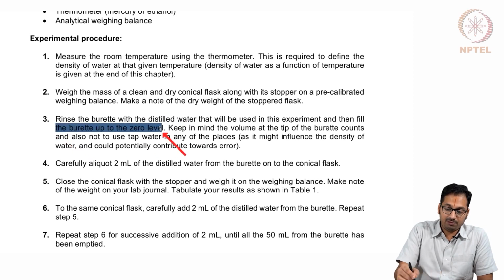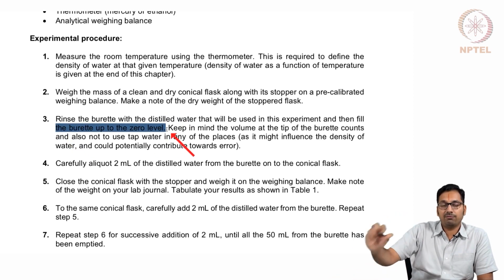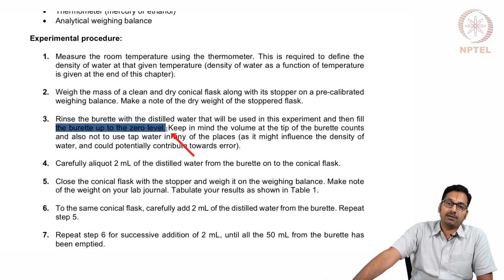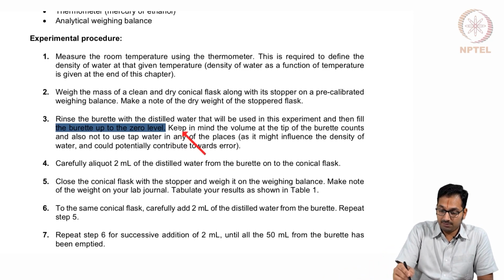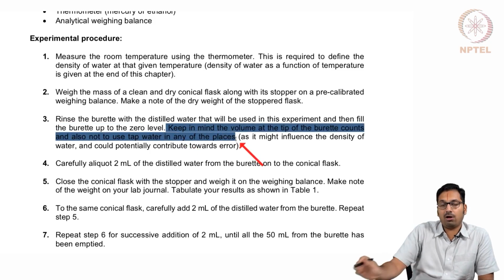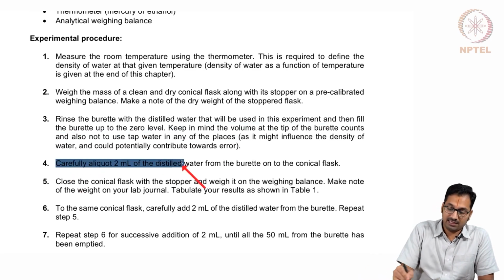Remember to fill the burette up to the 0 level. This is a mistake many students end up doing, where they do not fill up the bottom part of the burette where the solution comes from, and this results in a systematic error of about 1 to 2 ml depending upon the make of the burette. Yeah, that is the same point that is written here. So, generally a protocol, as you are able to realize, will also have the information of do's and don'ts in order to minimize the influence of the error that might end up coming. Okay. Now starts the experiment.